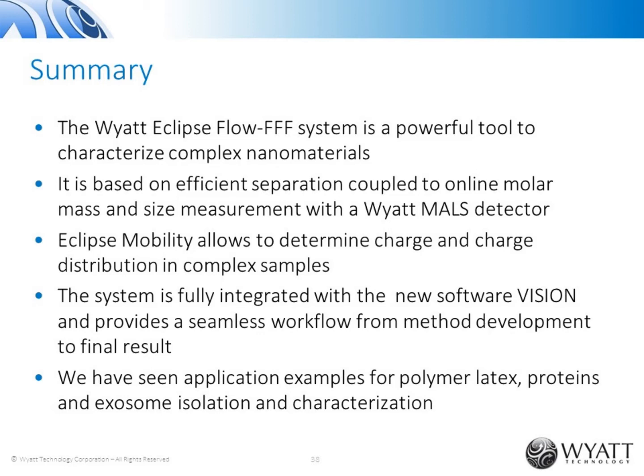Okay. I have a question here that says, how high can we increase the molecular weight of polymeric nanostructures with the AF4-FFF method, normal light scattering? How can we increase the molar mass size? I don't quite understand that question. What we can do is measure the molar mass and the size. But what's the question? How can we increase the molar mass? Yeah, the molecular weight of polymeric nanostructures, the AF4.